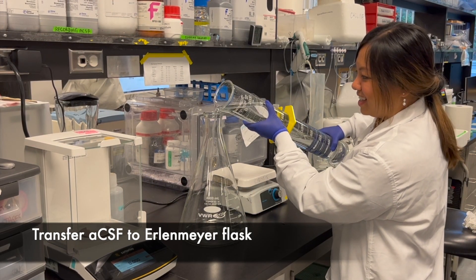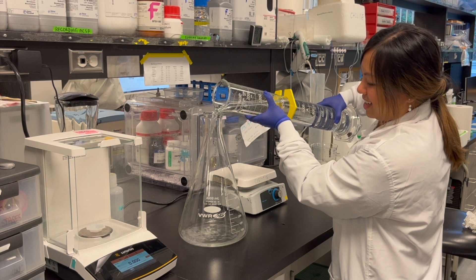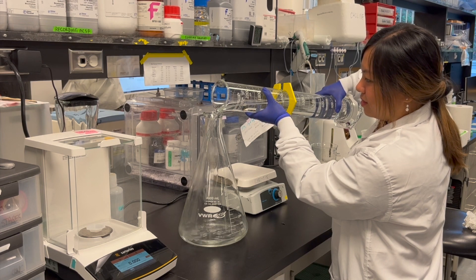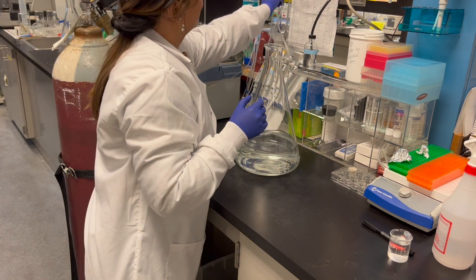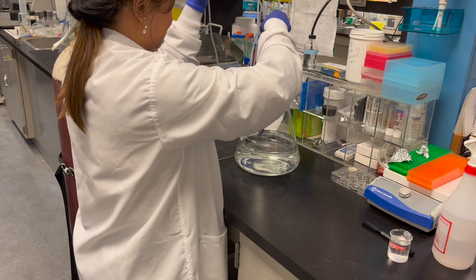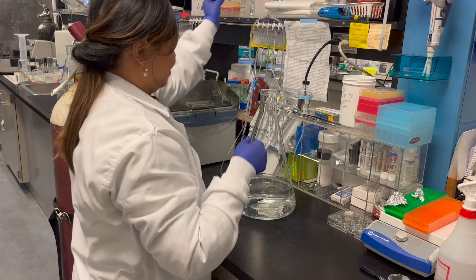For brief storage in a four degrees Celsius fridge or during experimental procedures, we keep our ACSF in an Erlenmeyer flask. Place a bubbler with carbogen, which contains 95% oxygen and 5% CO2, into the flask. Your ACSF solution should be bubbling for at least 10 to 15 minutes prior to use in an experiment.